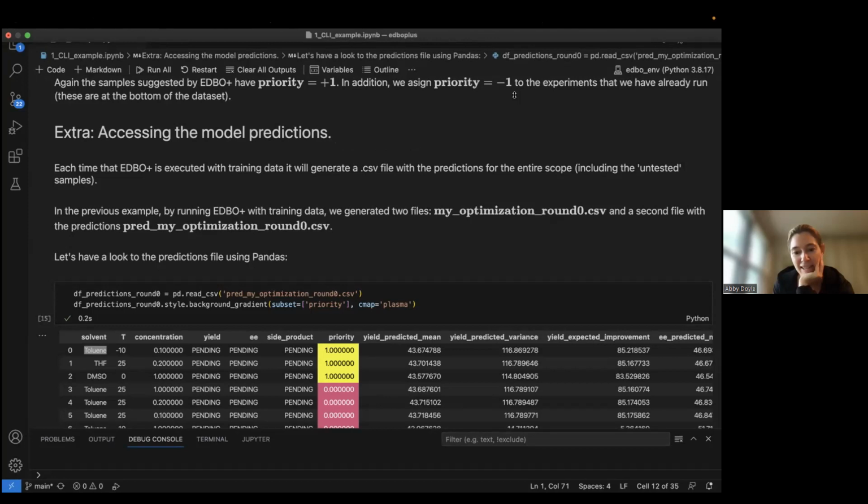In the cases that we've looked at, usually it's 1 to 5% of the total search space as the number of experiments where you start to see convergence. But like Daniel said, it does depend. And certainly, you can define a very large search space where that 1 to 5% becomes impractical.